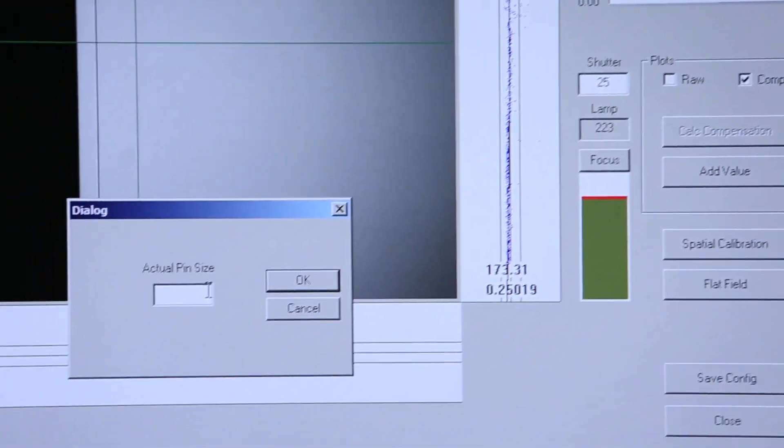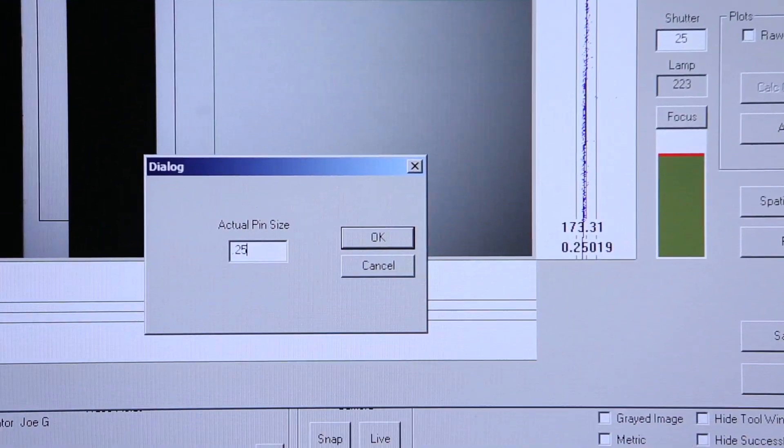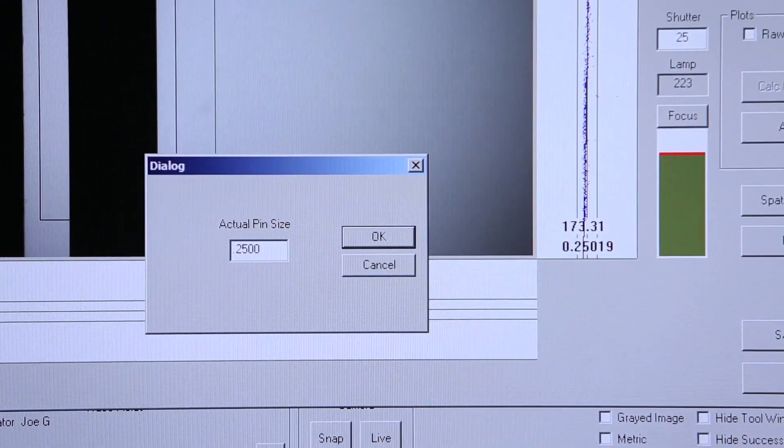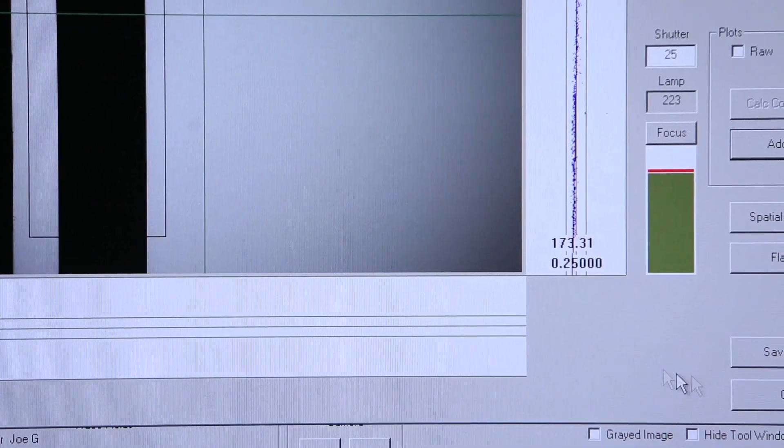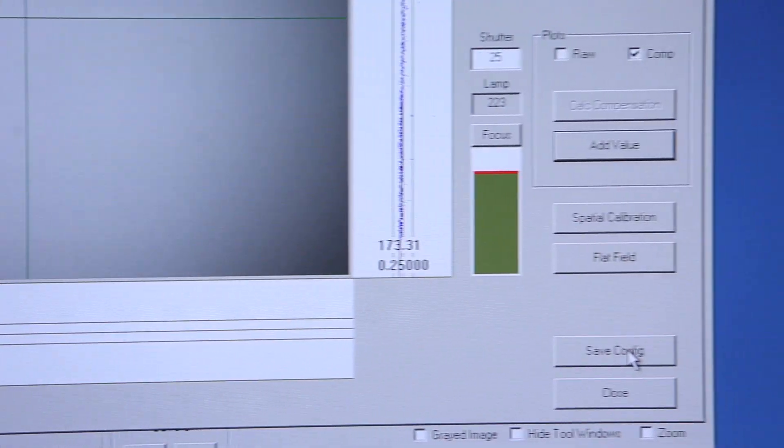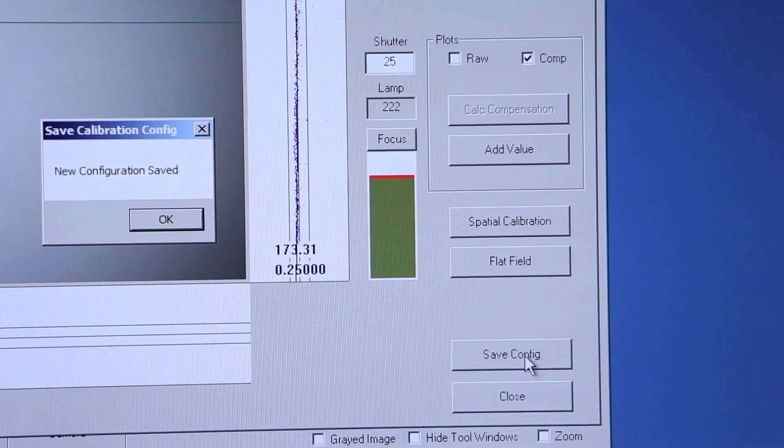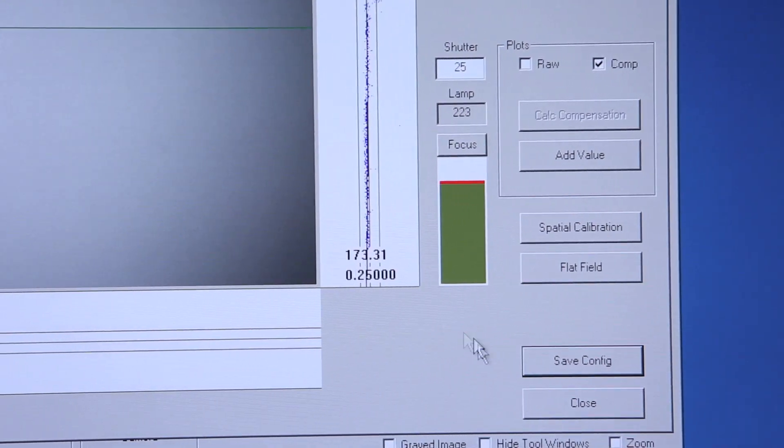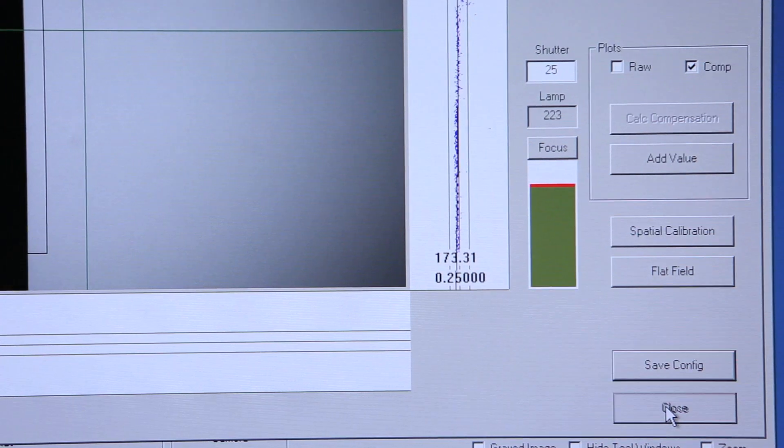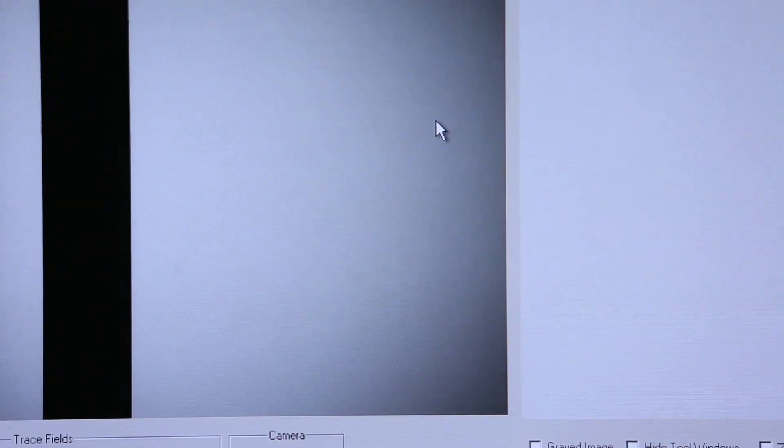Save configuration at this point, and now we can close out and the unit is calibrated.